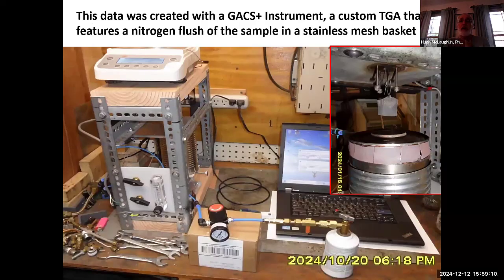So this is the apparatus that I'm going to use to create the data. Now, this is a new apparatus. I developed this recently, in the last year or so. It's a modification of the one I've used in my lab for decades. And it's essentially a thermogravimetric analyzer, or a TGA, as they're called.